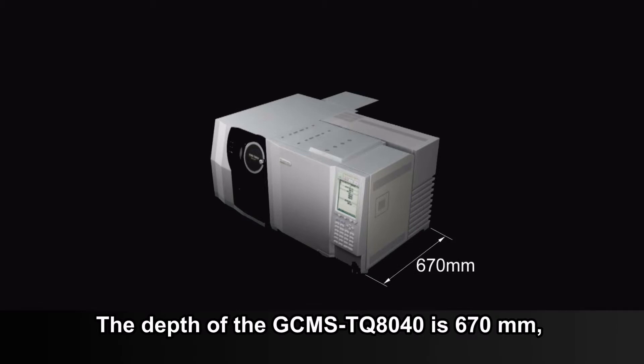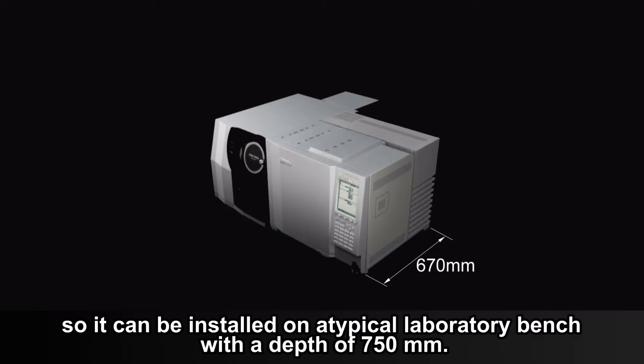The depth of the GC-MS TQ8040 is 670 mm, so it can be installed on a typical laboratory bench with a depth of 750 mm.